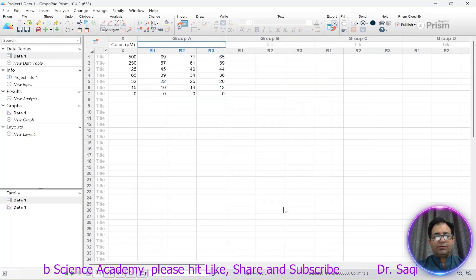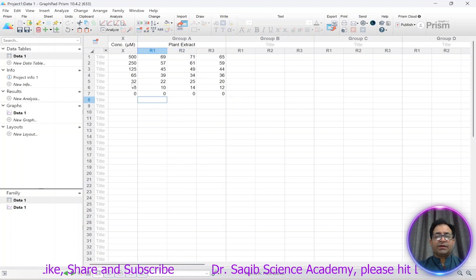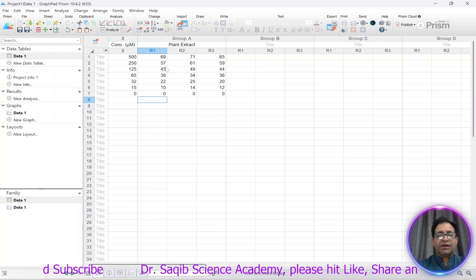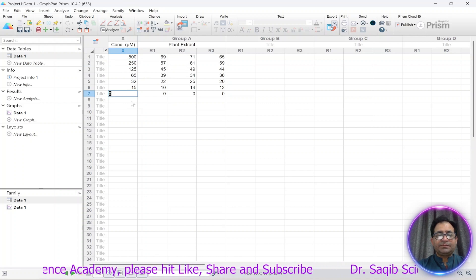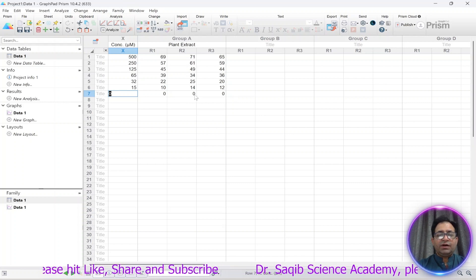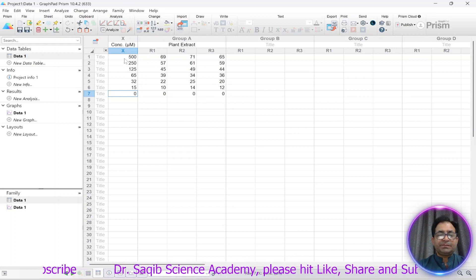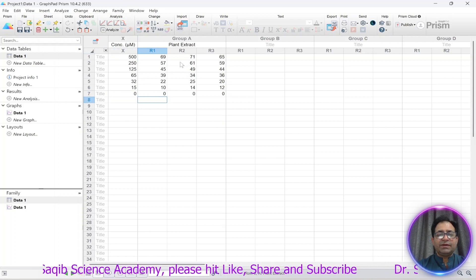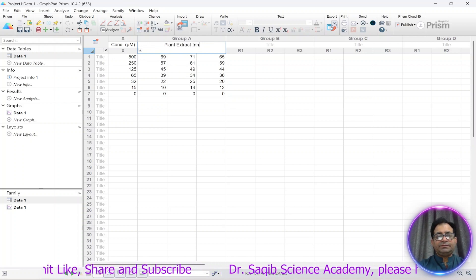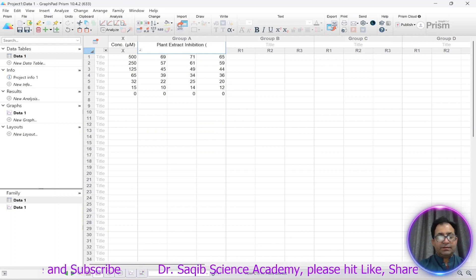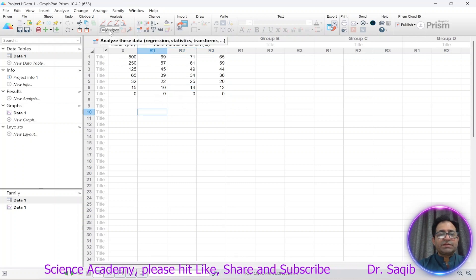Today I will discuss one plant extract with three replicates; in another video we will discuss different plant extracts and how to analyze them. The concentration ranges from zero up to 500. At zero concentration there was no activity so all values are zero, and at different concentrations the plant extract shows this percent inhibition.